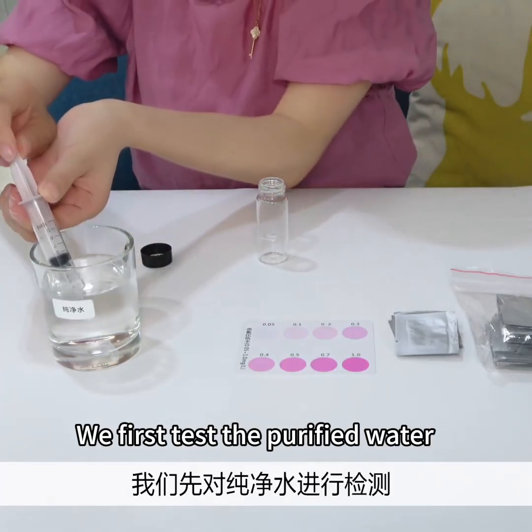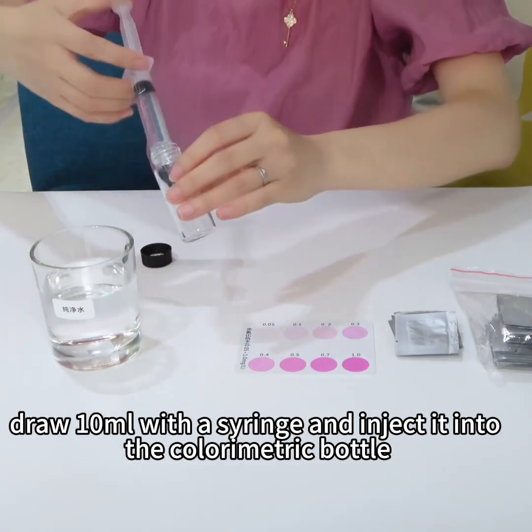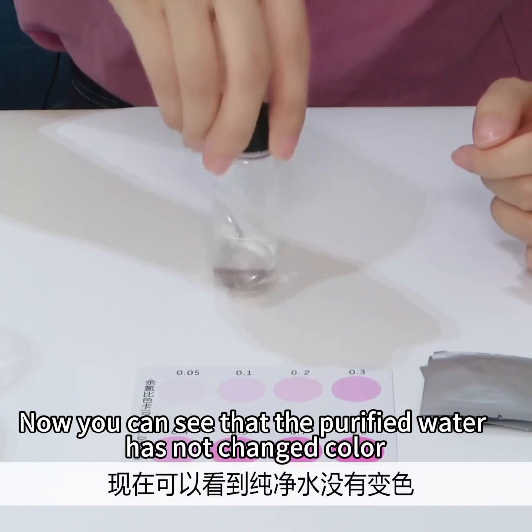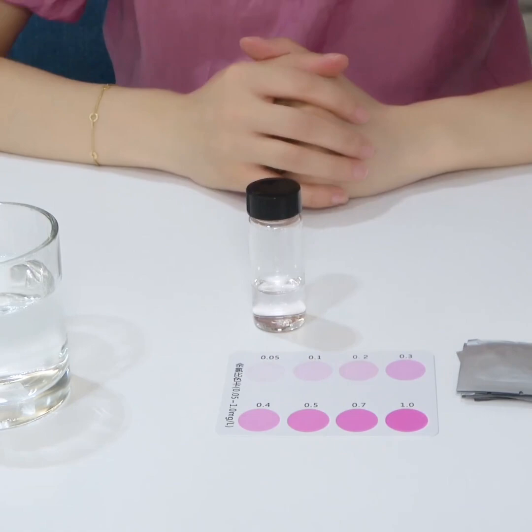We first test the purified water. Draw 10 milliliters with a syringe and inject it into the colorimetric bottle, add one pack of residual chlorine reagent, dissolve and shake well. The purified water has not changed color, indicating that the water does not contain residual chlorine.